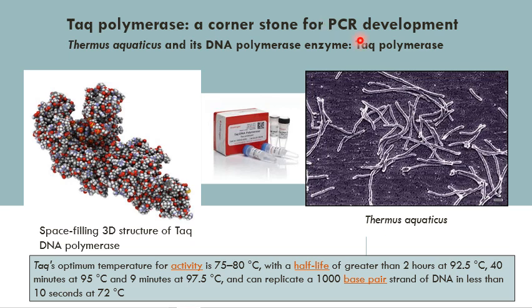We need to conduct this technique to amplify this certain piece of DNA instead of just copying the whole DNA. Take an example of a book, where you only need a small paragraph.